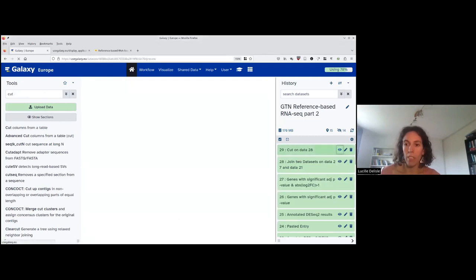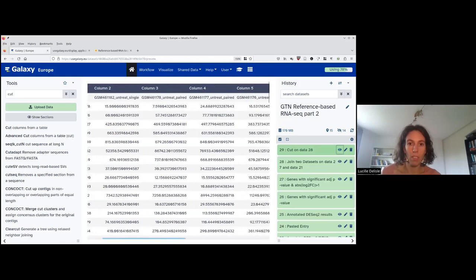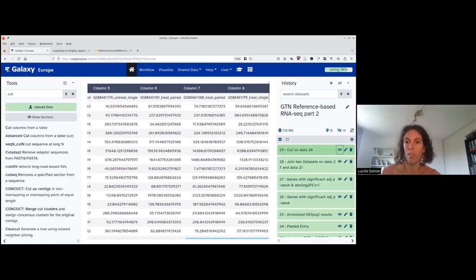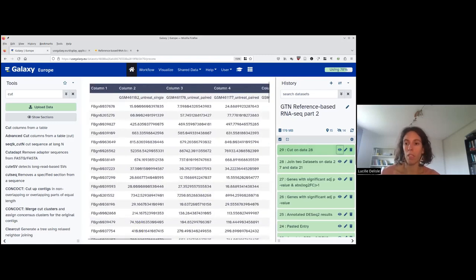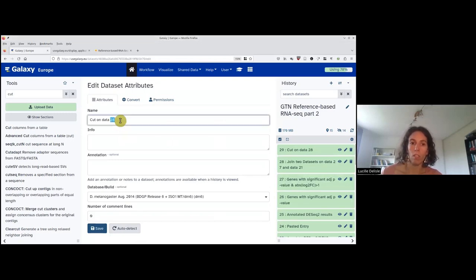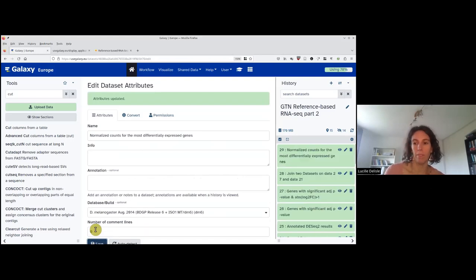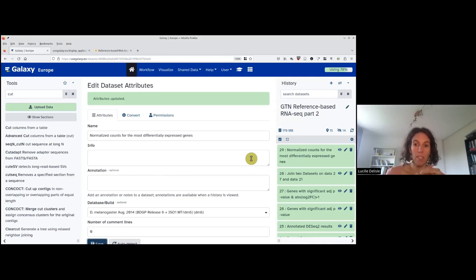It's done. I check with the eye that I get what I wanted: first column IDs and then seven columns for all my samples. I rename this dataset 'normalized counts for the most differentially expressed genes.'